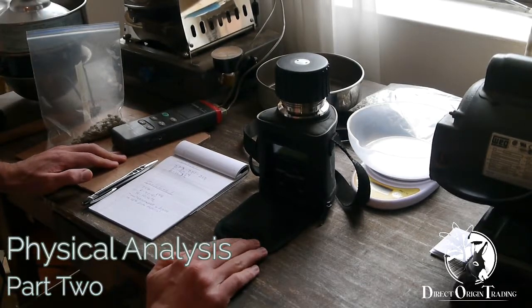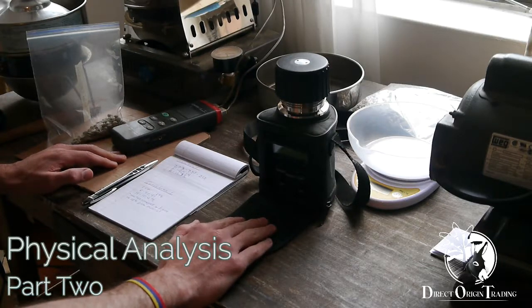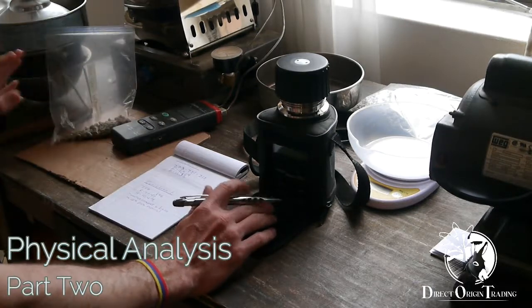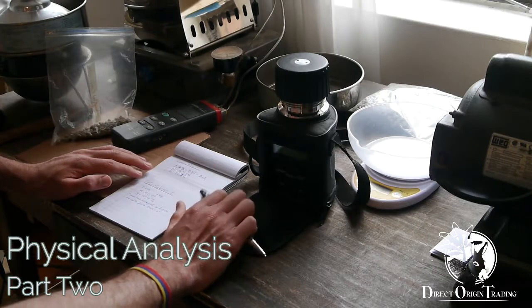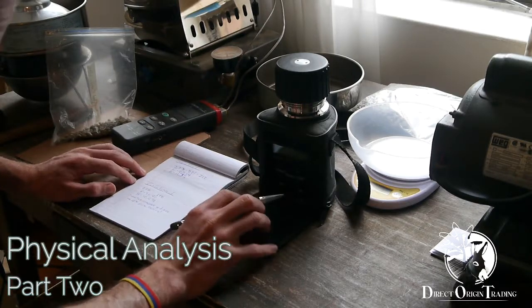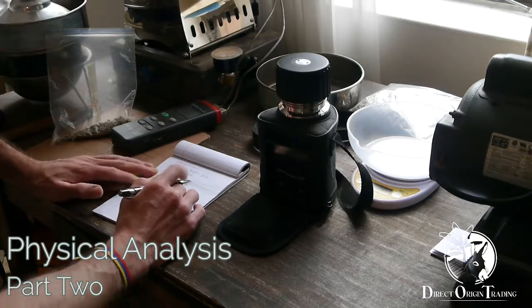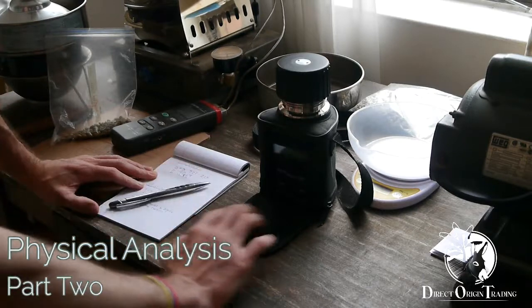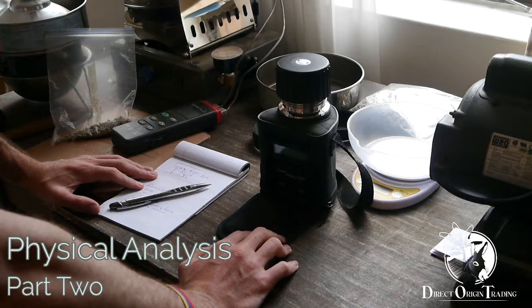But more than anything, it's too high because the weather sometimes makes it really difficult to get it down further, and many farmers don't have the drying infrastructure to properly get that moisture content down evenly a lot of the time. And it looks like this sample is not where it should be. This is at 12.5%, which is exactly the legal limit.